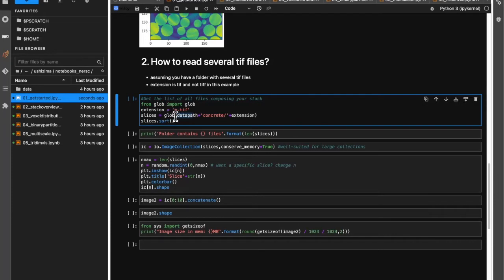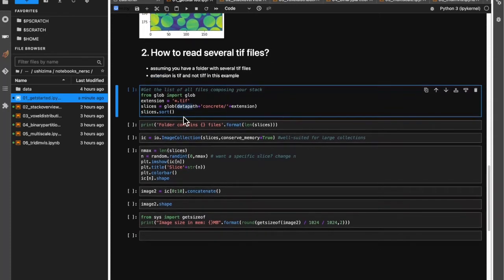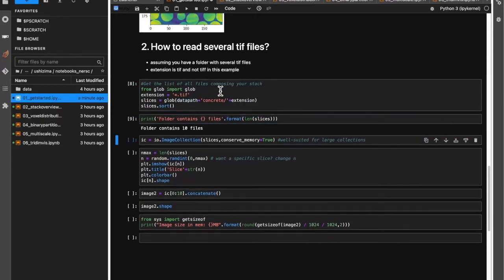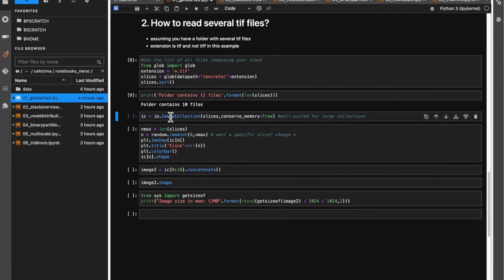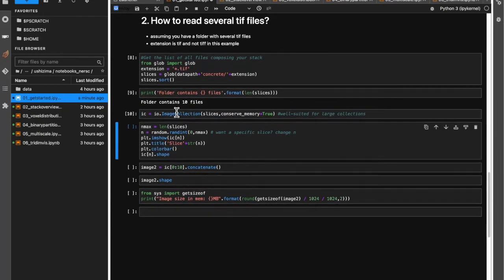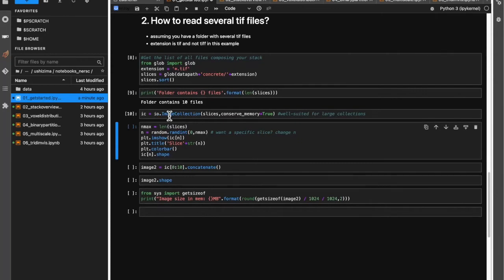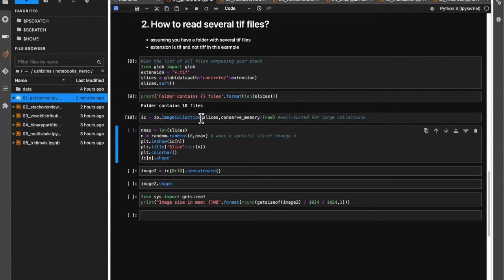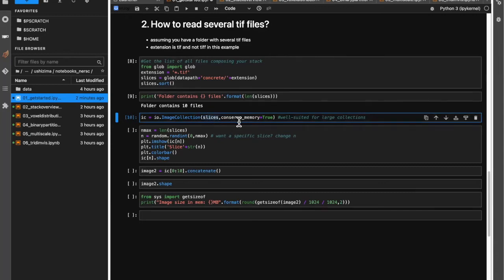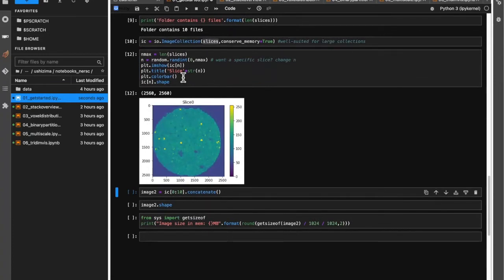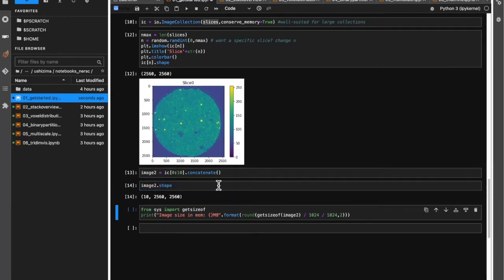I want to use Glob to read all the file names — not the images themselves. So I have an assortment I'm calling islices. I'm being very careful here, assuming these files are very large. I'm just dealing with 10 files. Let's create a connection to those files using a function called image collection. Notice how this is occurring: I'm sending a list of file names in my variable islices, and I'm saying conserve memory, which means I'm not loading all those images. Once you are convinced that your data is there, you want to get all these 10 files and put them in a single numpy array — a 3D array. And that's how you do it.